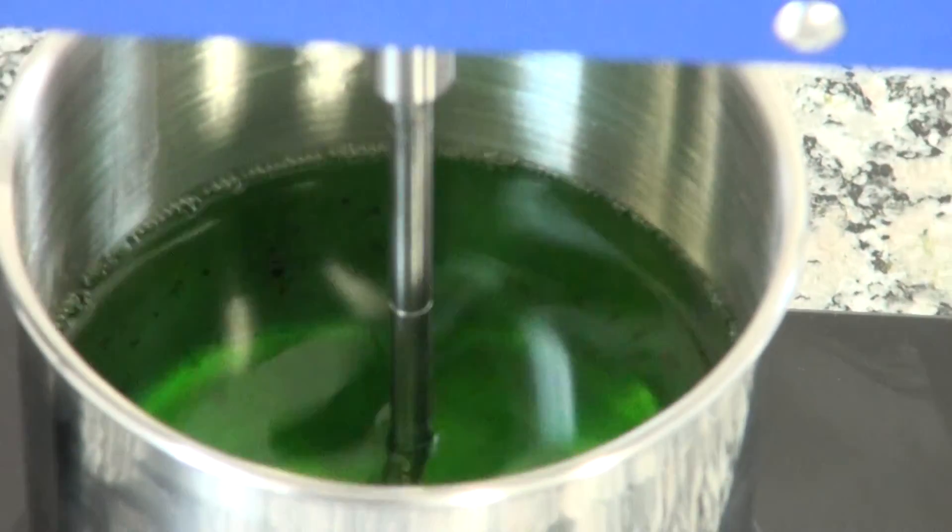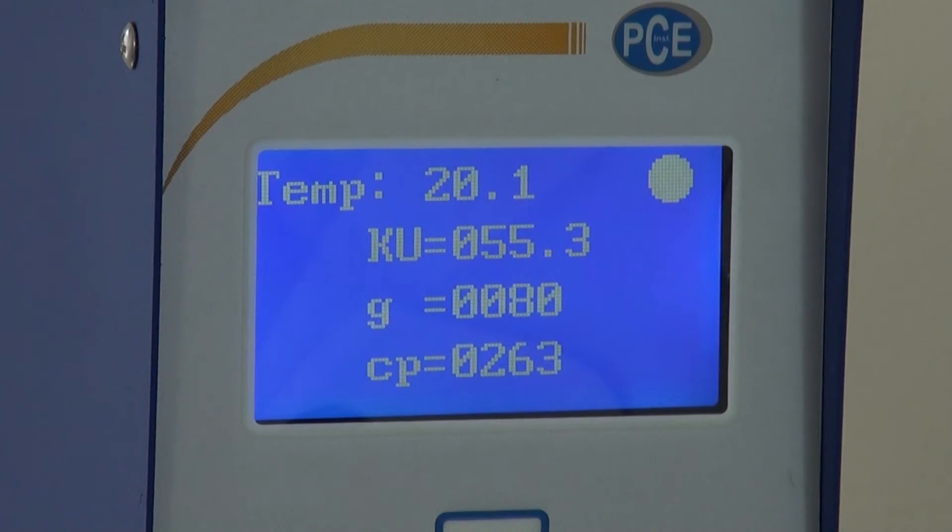Simultaneously the KU value, the Gram value and the Centipoise value are displayed. We measure a KU value of 55.3.